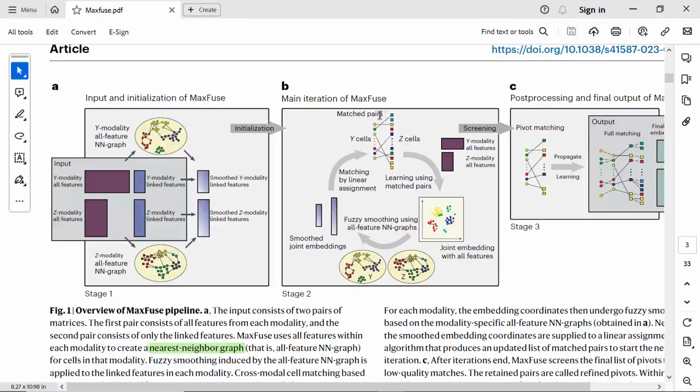The matched pairs are for the shared data because they have the same gene names in the columns. Because of the weak link between the shared data, if we create a joint matched pairs graph, then the graph will not be the best integration between protein and RNA data.